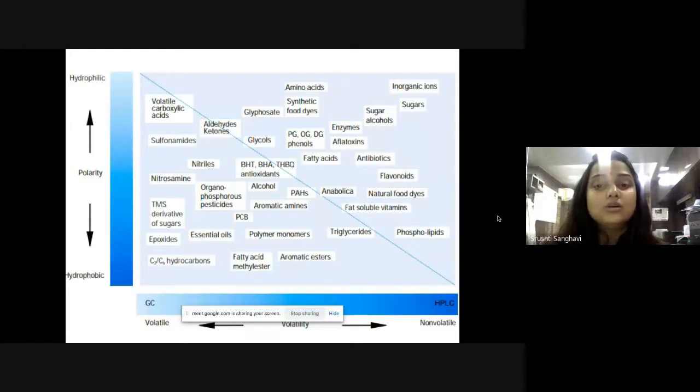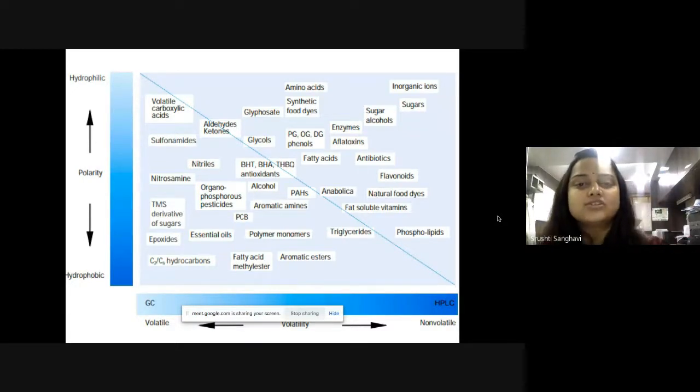So now, another very important part of this, we spoke about whether the perfume goes in as direct injection or in headspace, all of that. So how do you understand whether my sample is suitable for GC or not? That is the first question. Not all samples are suitable to be analyzed on GC. This, I hope, will help you get some idea of what can or cannot work.